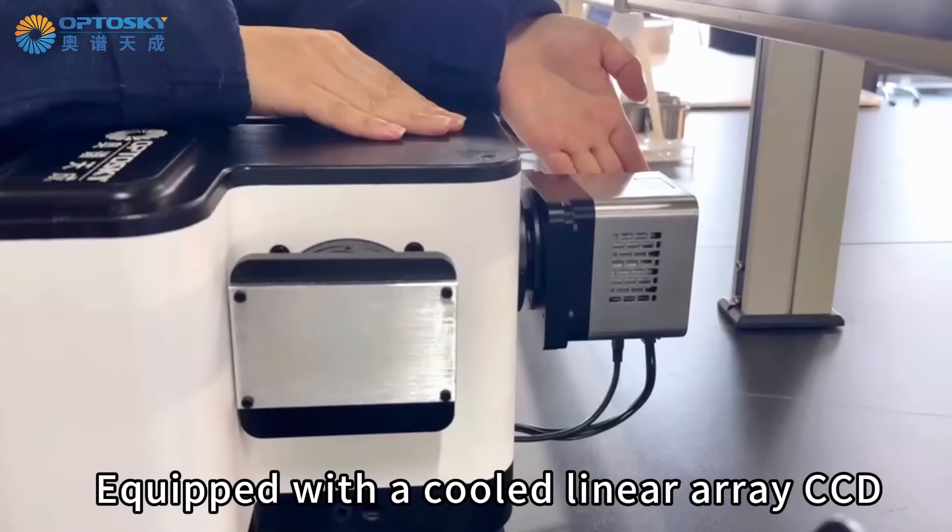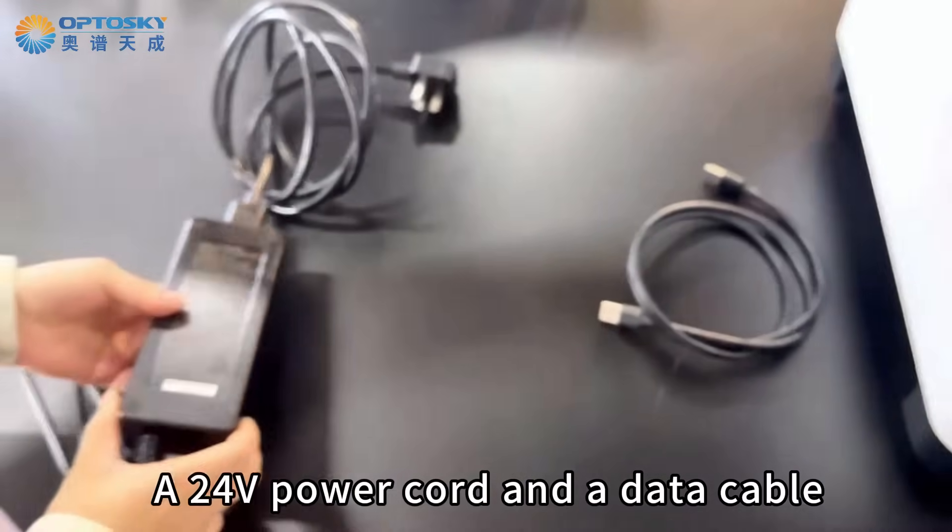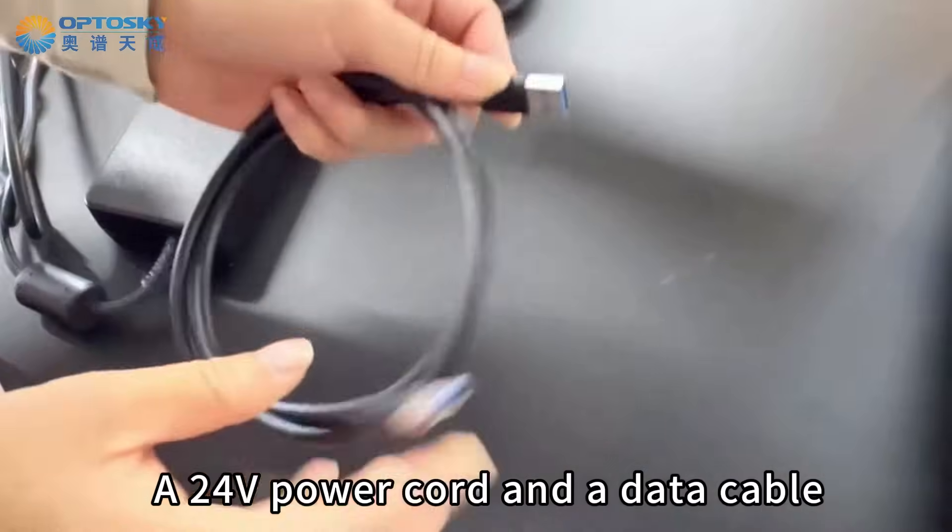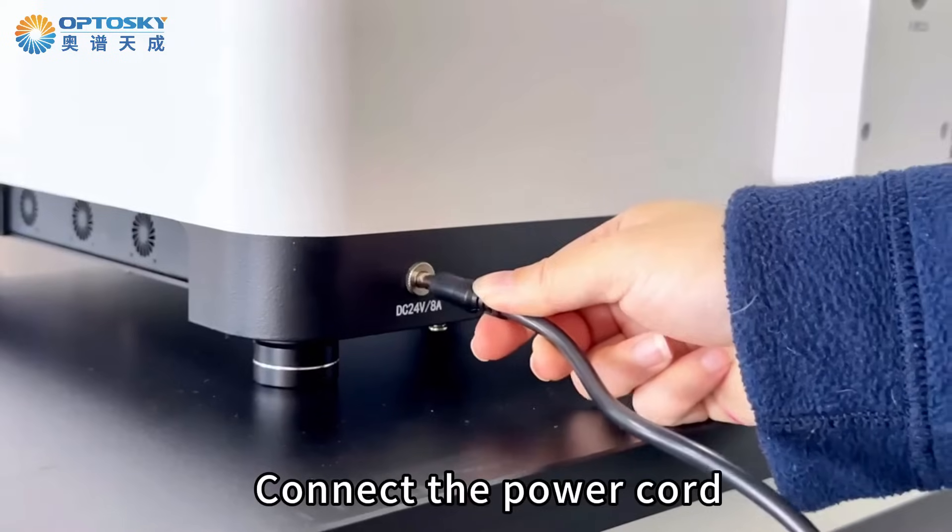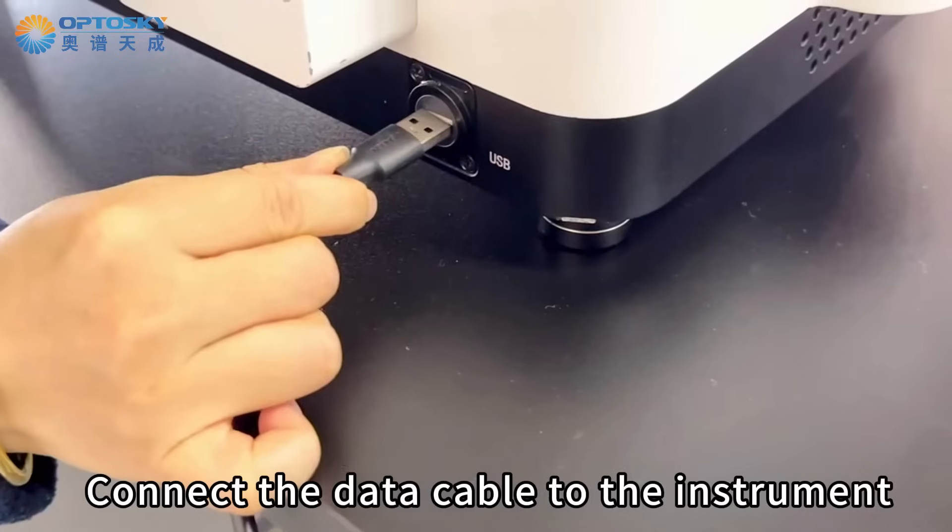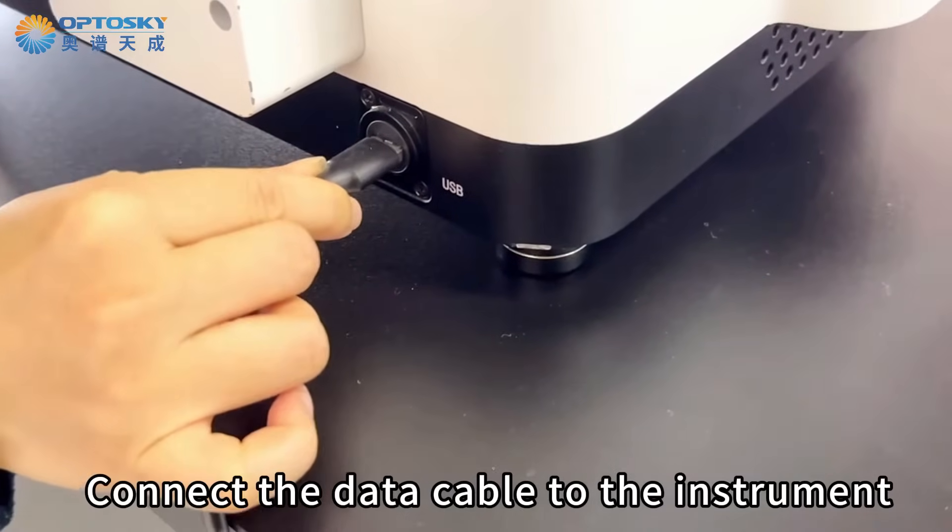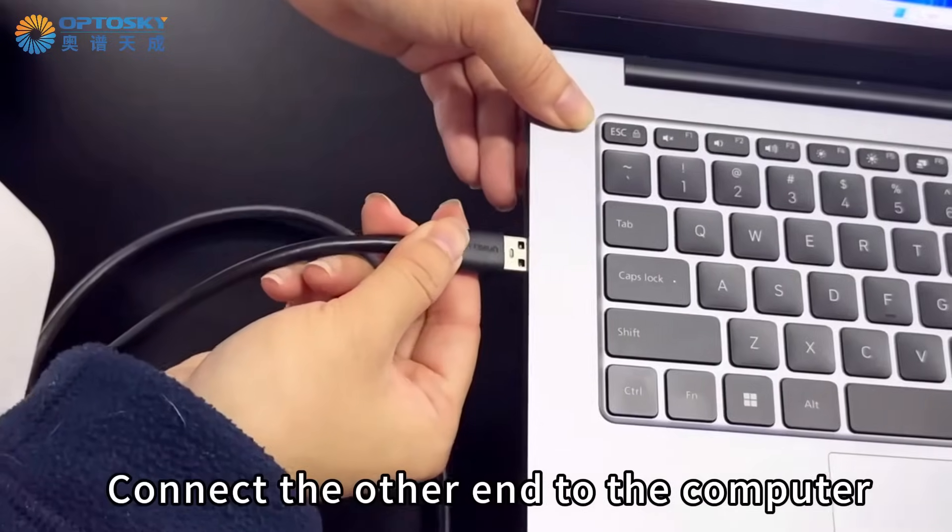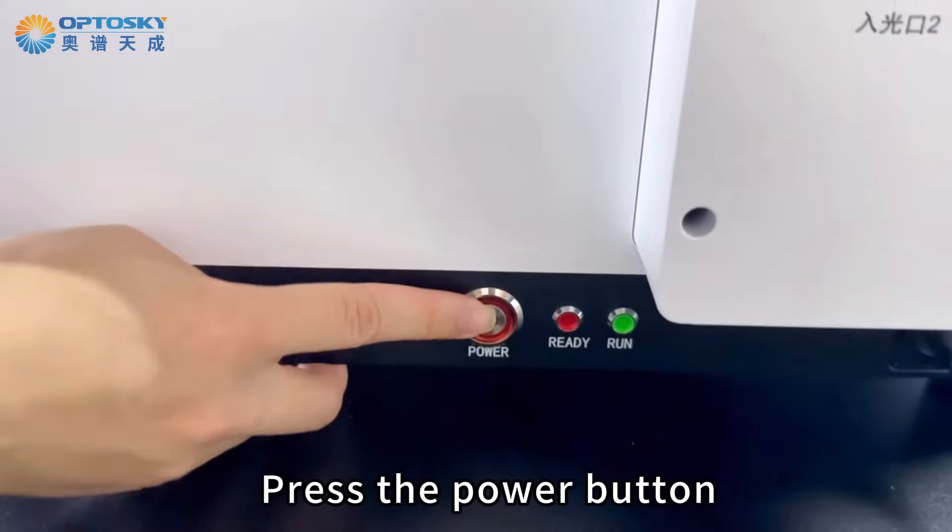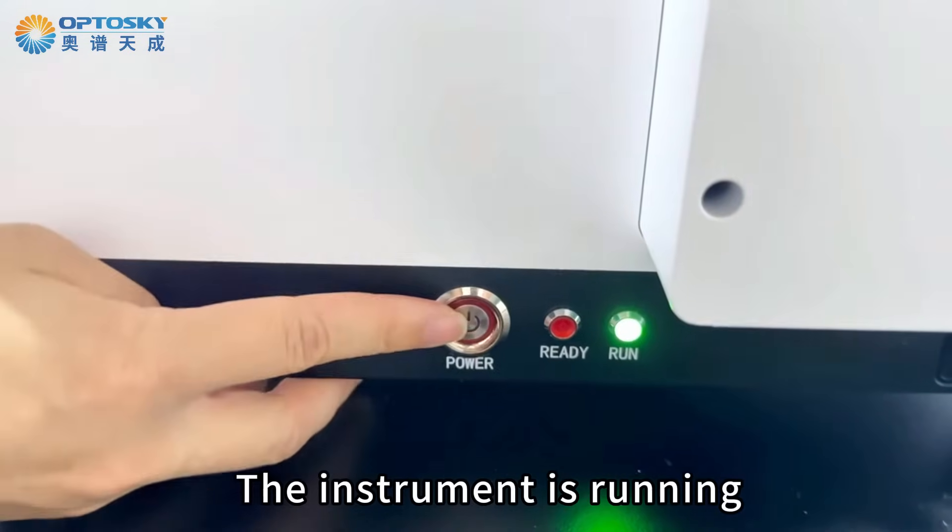Equipped with a CCD linear array CCD, a 24V power cord, and a data cable. Connect the power cord. Connect the data cable to the instrument. Connect the other end to the computer. Press the power button. The instrument is running.